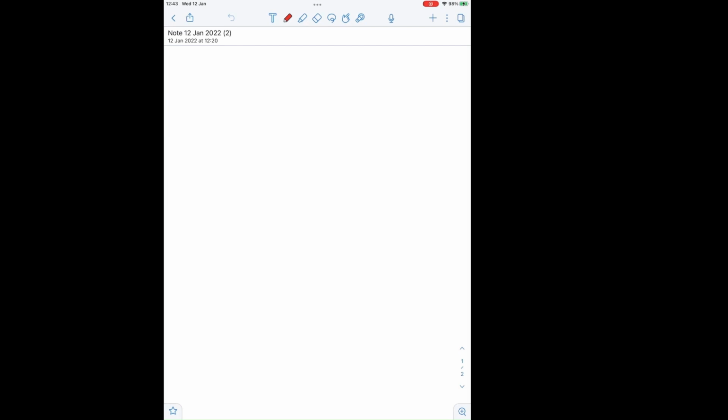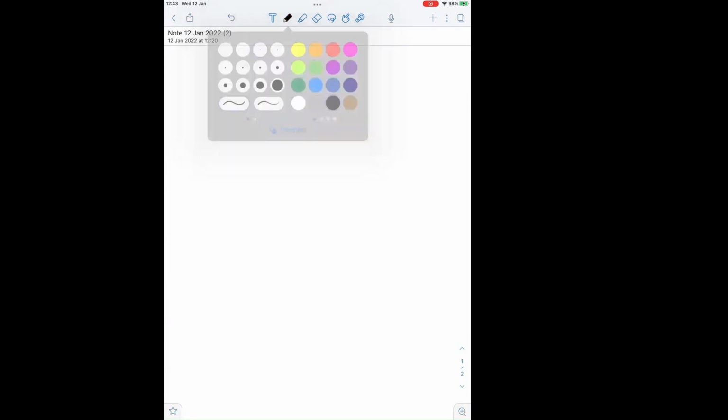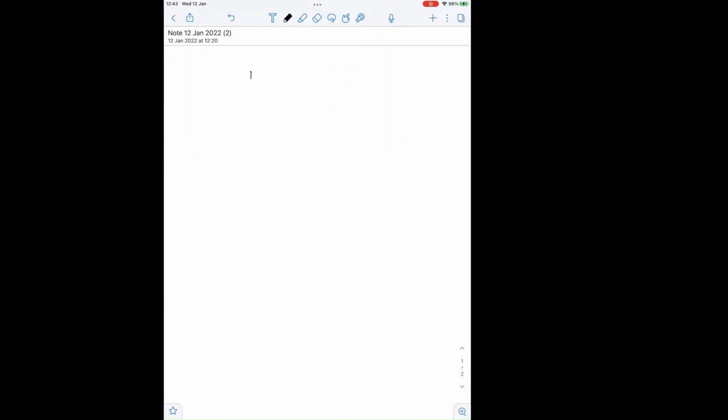But let's see what we mean by potential, and I'm going to start off, and I'm going to keep my life very easy and consider, I've been marking, so I've got the wrong color pen on. I don't want a red pen, I want a black one. Okay, so we're going to consider Fe3+ plus an electron going to Fe2+.